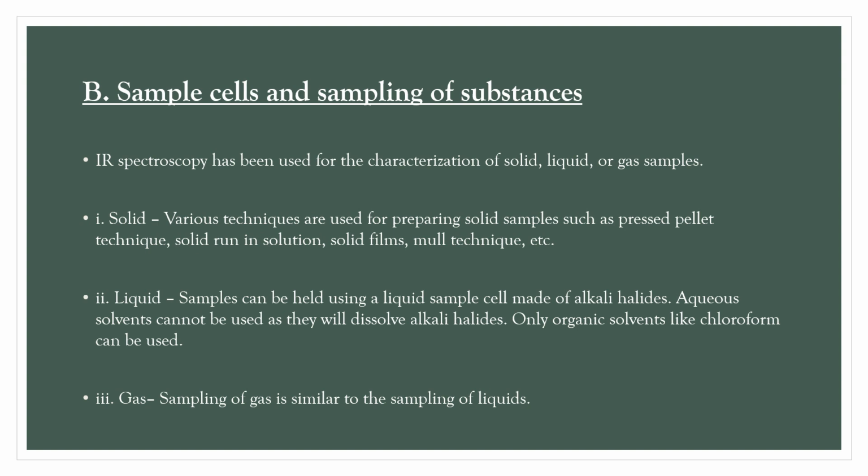Samples can be held using a liquid sample cell made of alkali halides. Aqueous solvents cannot be used as they will dissolve alkali halides. Only organic solvents like chloroform can be used. Gas. Sampling of gas is similar to the sampling of liquids.